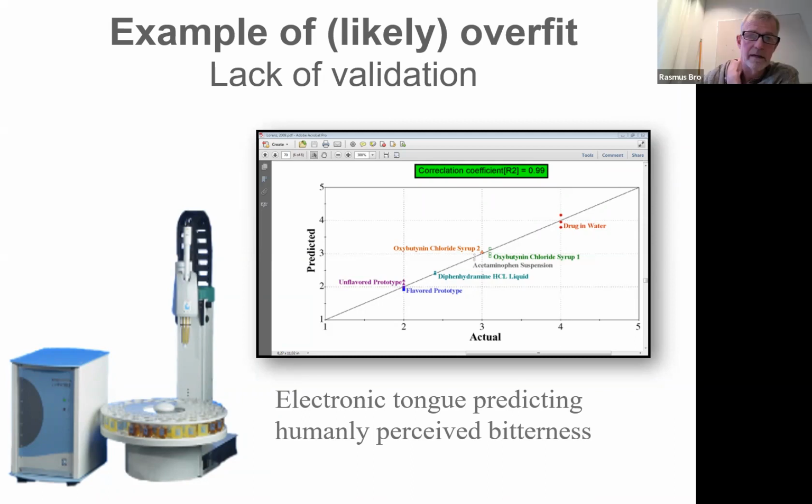Yeah. So you definitely have to be extremely careful with validation. Now, I don't know what kind of electronic tongue you're working with. Some of them are extremely bad with respect to drift and with respect to analytical results. So I would build this up very slowly, like taking different concentrations of each chemical and building a standard series and see if that works. And then just see if you can actually see the chemicals, and then really focus on validation, making completely new samples and predicting those.